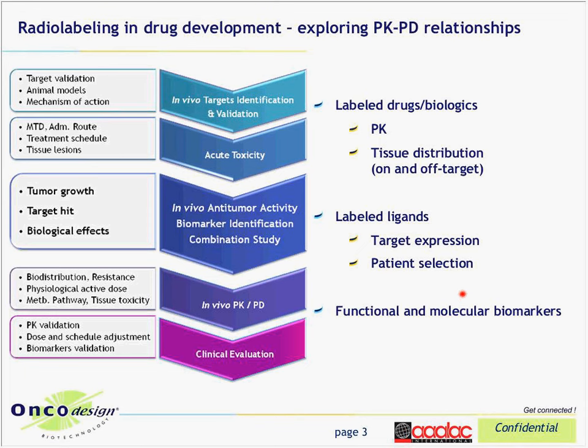So to do all this useful work, labeled molecules, and mostly radiolabeled molecules, may be of help to investigate all the points mentioned previously non-invasively in the body of animals, in most cases mice and rats. Radiolabeling is a technique for linking a radioactive element to the molecule to be studied. Through this webinar, I am going to show some examples of labeled drugs for measurement of biodistribution and pharmacokinetics parameters, evolution of target expression, and all types of molecules that can be used as biomarkers.